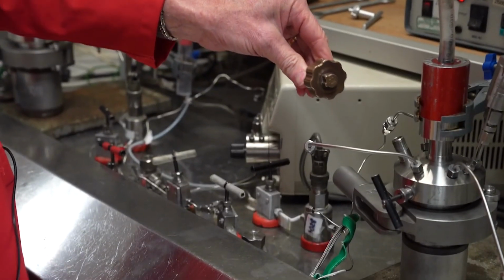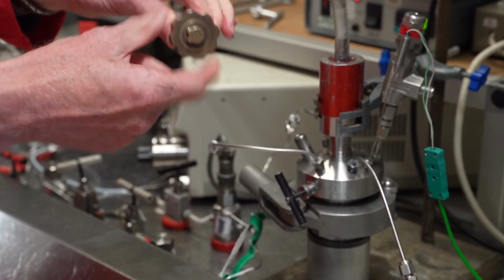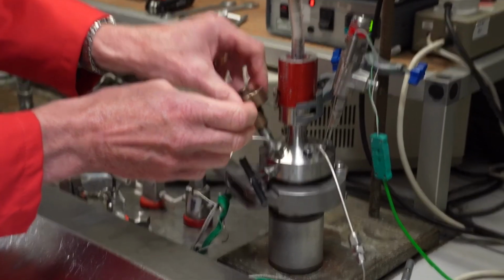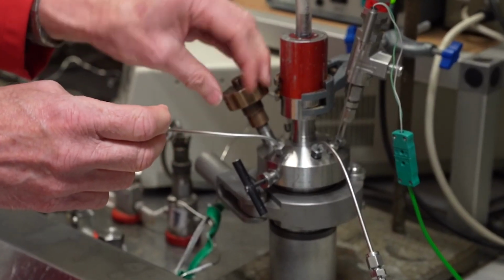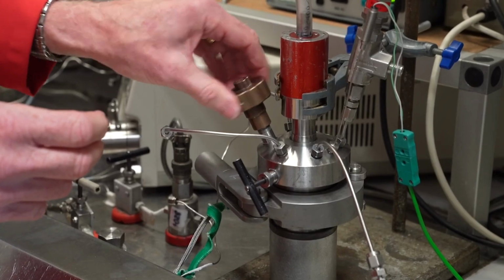And this is important because the only way that I can open this up is by having this key in my hand. But this key is also the high pressure valve here, or high pressure safety valve. So this gives us the final seal. So the last thing we do is we put that in place and seal it up.